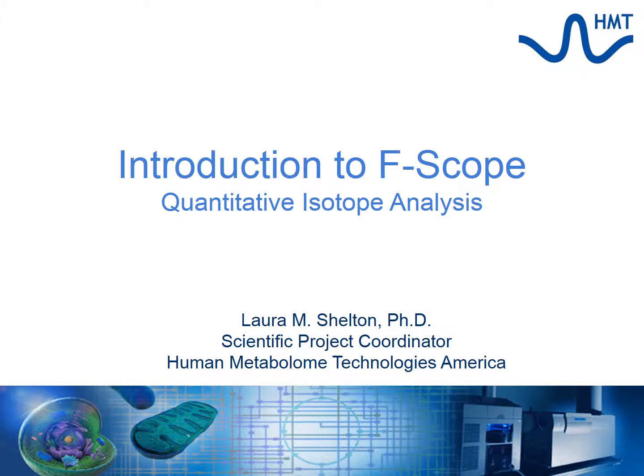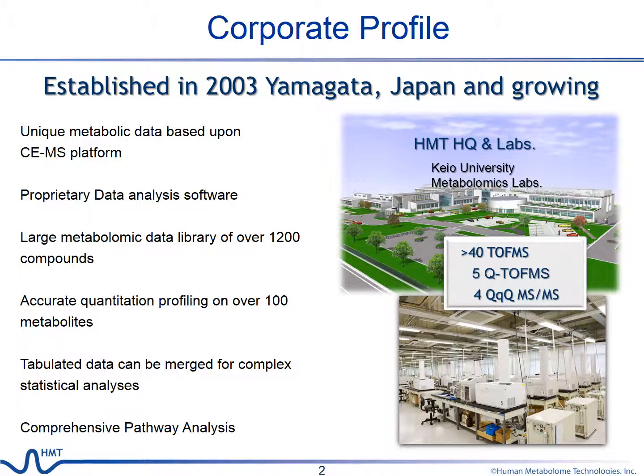Today, I would like to give you a brief introduction to our new analysis package F-scope for quantitative isotope analysis. To start, I would like to tell you a little bit about our company.